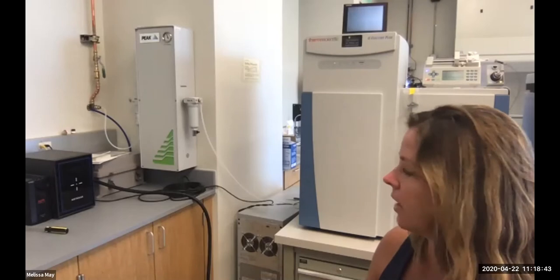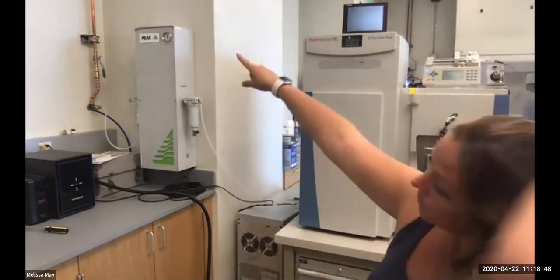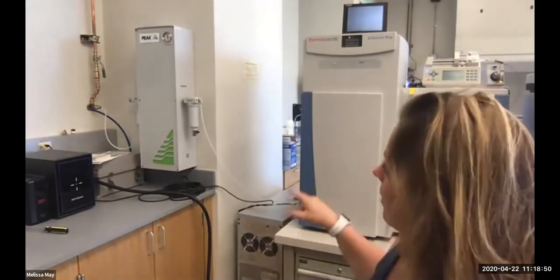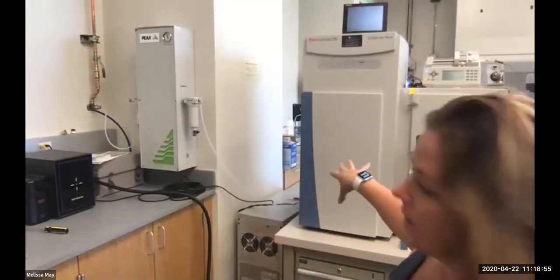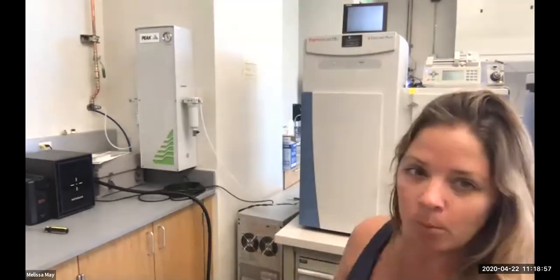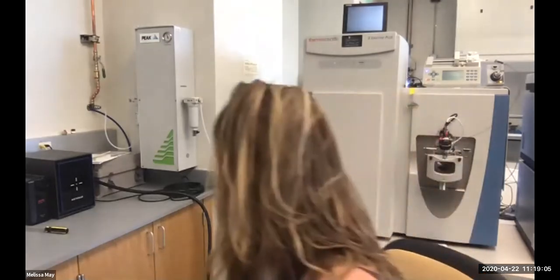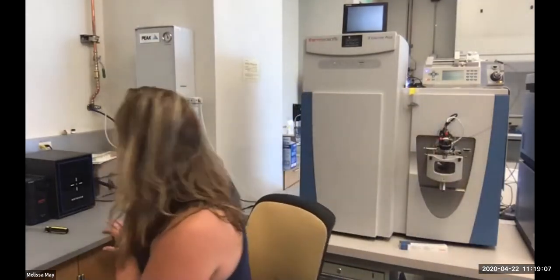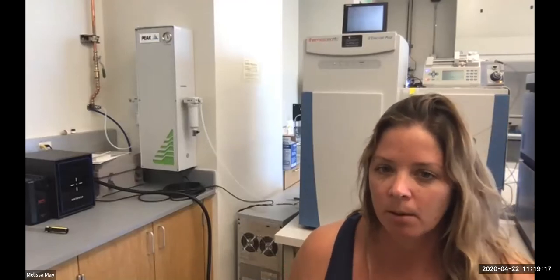We rely on nitrogen. And so we use house air that's pumped in through the building and this Peak nitrogen generator that converts it into nitrogen and then is hooked up to the instrument. The output pressure on this is the only thing that you need to check. The instrument recommends, I think, somewhere around 100 PSI. Ours at the highest is around 90, but that seems to be sufficient. So anything that's above 80 has been working for our purposes.